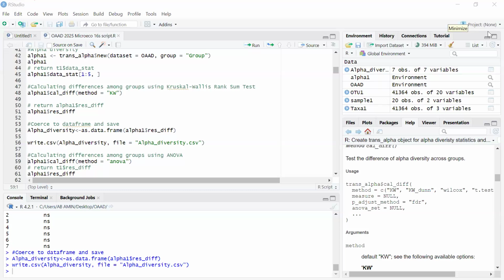Please, those participants that are with their computer sets, can you download the data, and then he will take us back so that we can start afresh and follow. I don't think he needs to start afresh. You just run the code up to where it stopped. Okay, fine. I should start afresh? I think it's better. Can we give them a minute or two to download the data? Well, what we do now, probably we just go to the file where they upload the data, because they are using their computer now, so they will probably need to edit the file path. Yes.